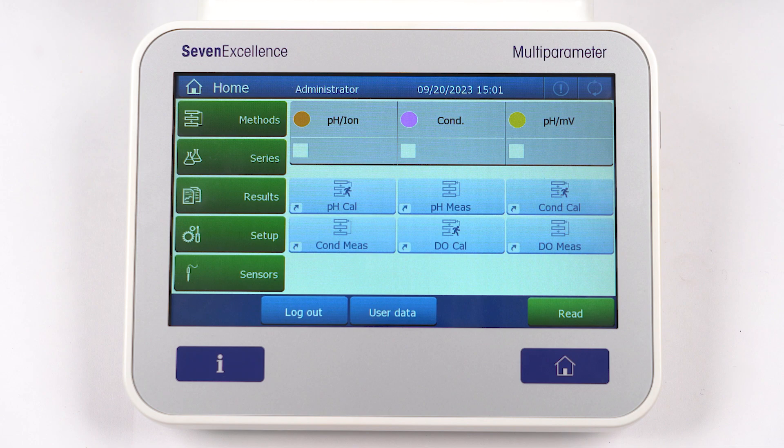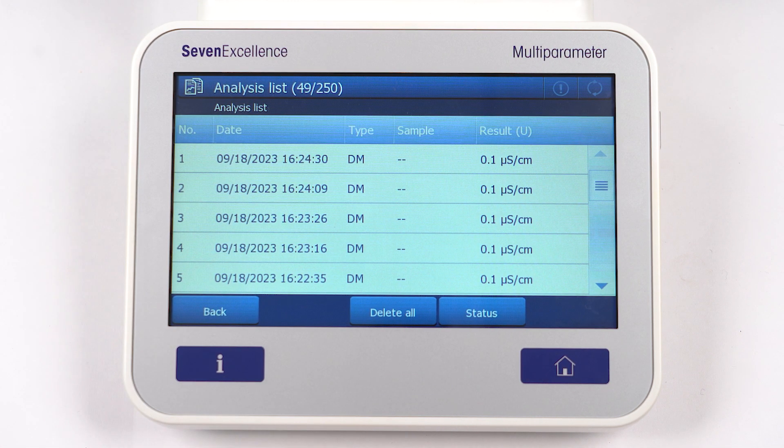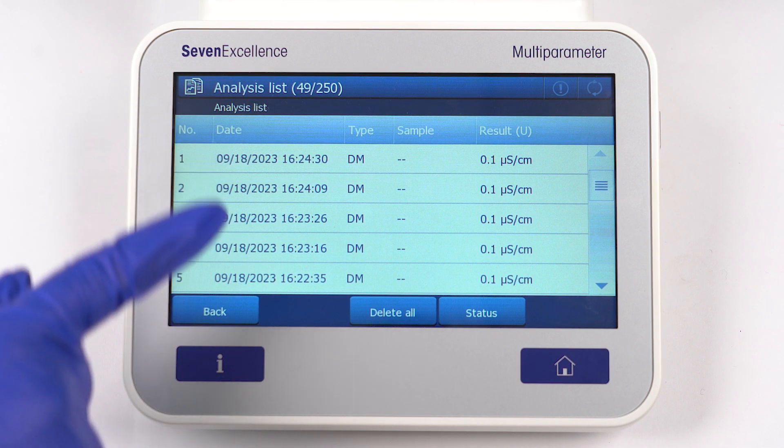The Results menu is where all the results are saved, along with information on the measuring setup and sample.